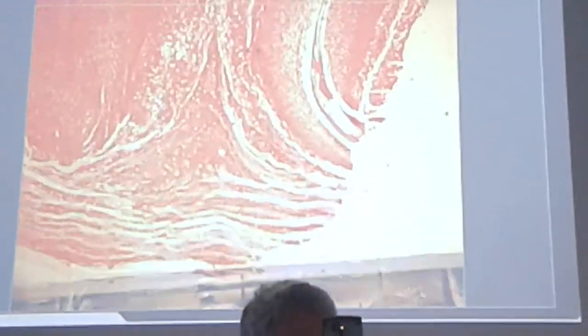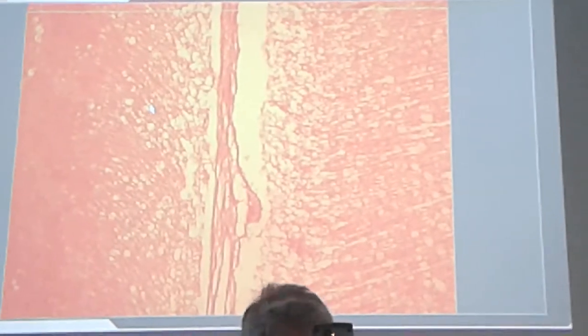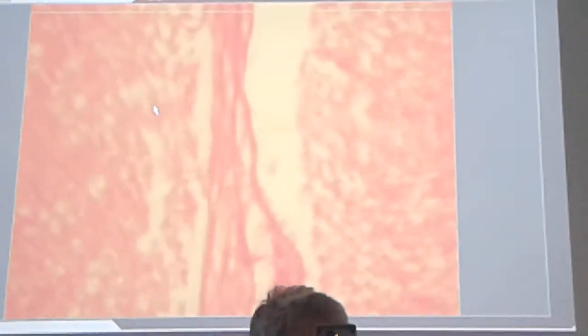And the lobes part. And if we make another magnification, we can observe from the crown part the enamel layer, mainly formed by the enamel rods, and the dentin material, with odontoblast-type cells here, resembling the dentin part.